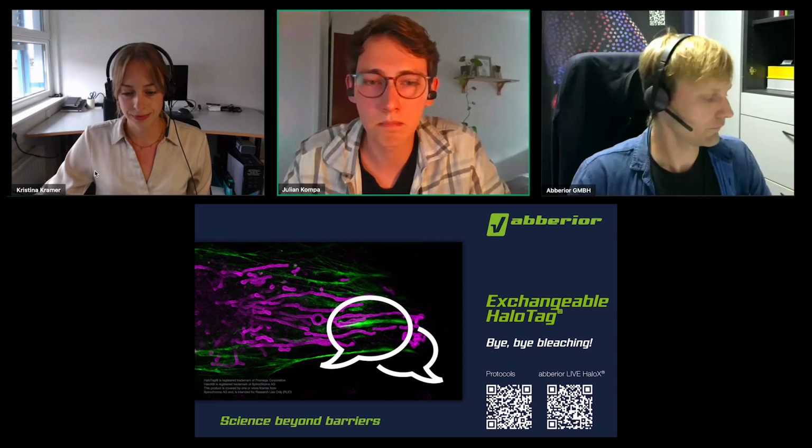Thank you. Good question. So I think what helped a lot is that we had already quite some structural knowledge about the probes and also about the HaloTag. And in the beginning, I did this very naive docking screen where I just tried to somehow fill the binding pocket with something that is not a leaving group. Other than that, we kept the ligand as it was, or as HaloTag was evolved on it. And something that is also very important to know is that HaloTag has some kind of an intrinsic binding specificity for rhodamines, especially carborhodamines, silicon rhodamines, and that helped already to gain nanomolar affinity in the end.